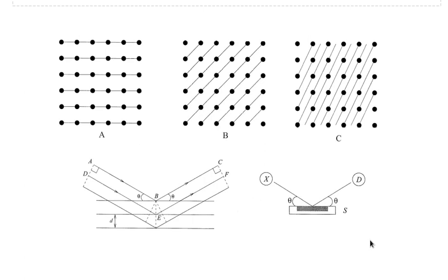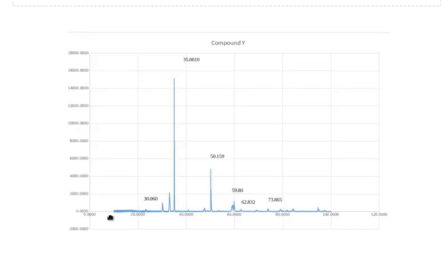But if you take lithium chloride or cesium chloride down to the instrument, and we've done it with previous groups, you end up getting the XRD comes back looking like this, and you can see the different intensities where you've got a positive reflection from layers in that, and there's a 2 theta value associated with each of those layers. So how do you work this prac?